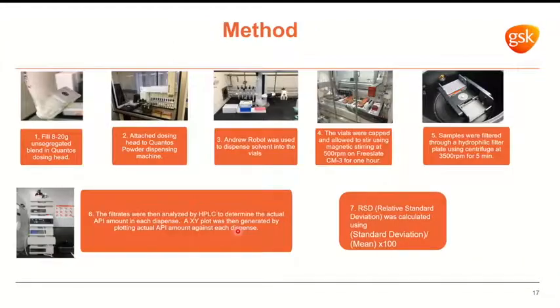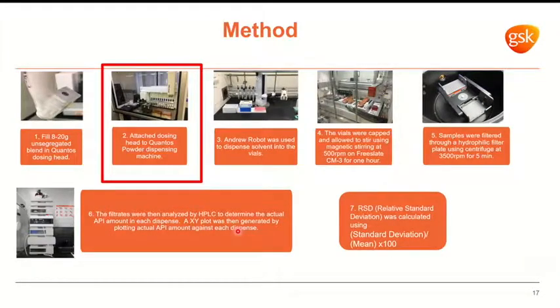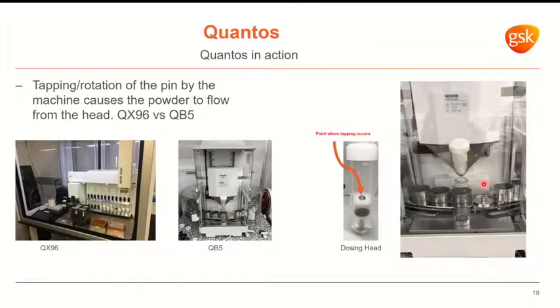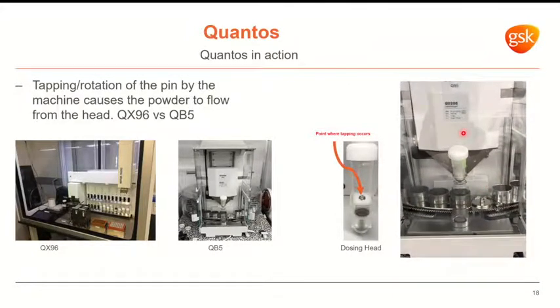Okay, so the second step of our workflow is that we are going to attach the dosing head to the machine, to the Quantos powder dispensing machine, basically the objective of my study today. Talking more about it, if you look at this video over here, you can see how this works.